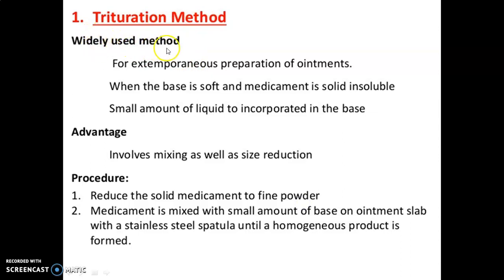This is a widely used method for extemporaneous preparation of ointments. When the base is soft and the medicament is solid, insoluble, then a small amount of liquid is incorporated in the base. Advantages: involves mixing as well as size reduction. Procedure: reduce the solid medicament to fine powder.